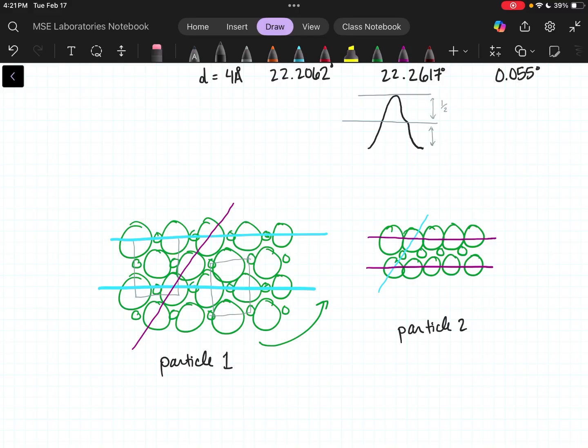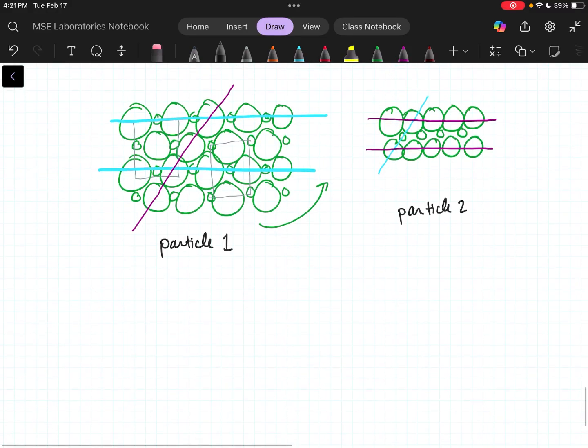So by having 2 salt particles, 2 little crumbs of salt instead of just the one, I'm now getting additional information. This is why we want randomized orientation: because of the different ways that I rotate this, a full 180, or just 45 degrees, or maybe I flip it forward, now I'm getting what I can't see in this 2-dimensional plane here. Each particle is going to diffract from a different plane, and so I'm going to get the full view.